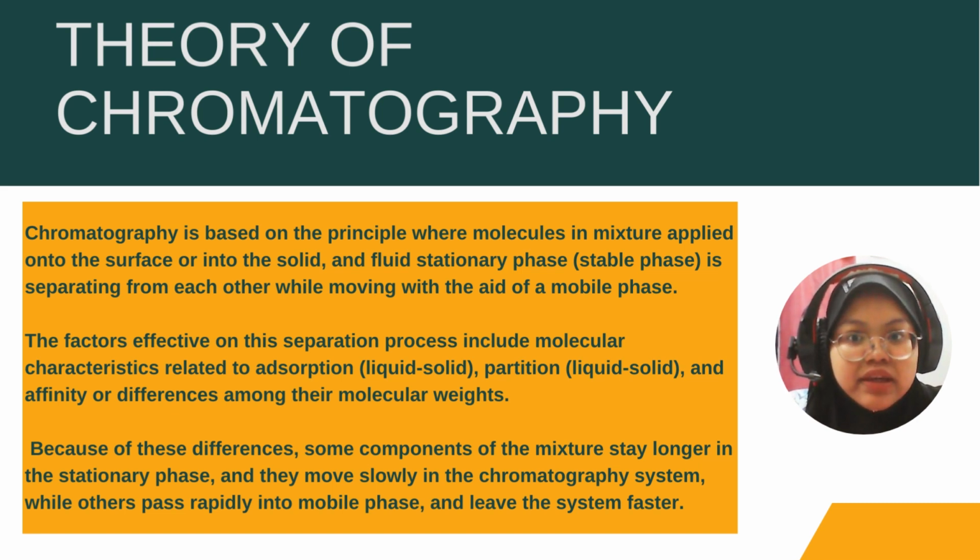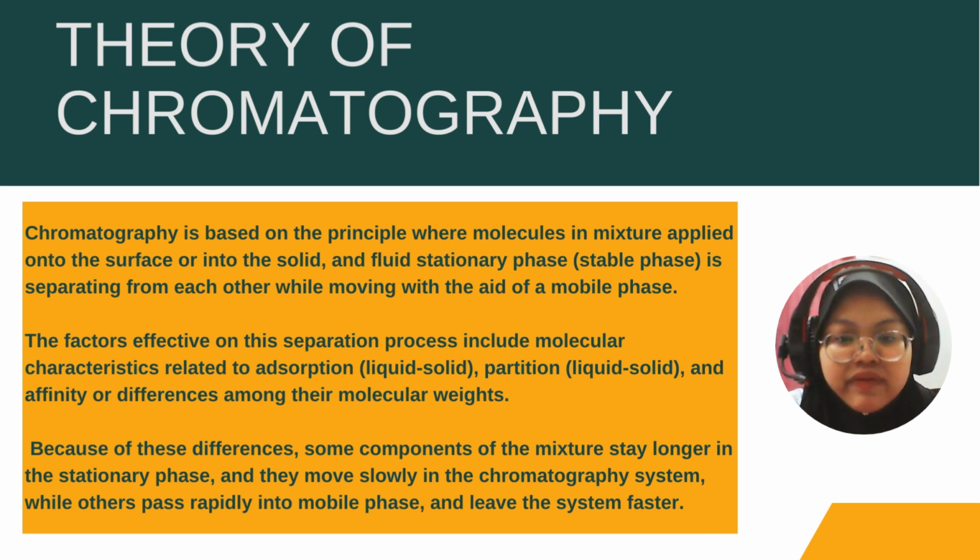Chromatography is actually based on the principle where molecules in a mixture applied onto the surface of a solid or fluid stationary phase separate from each other while moving with the aid of the mobile phase.